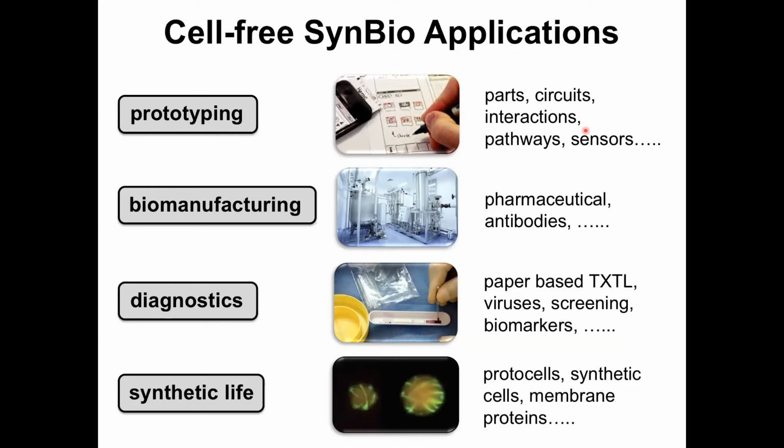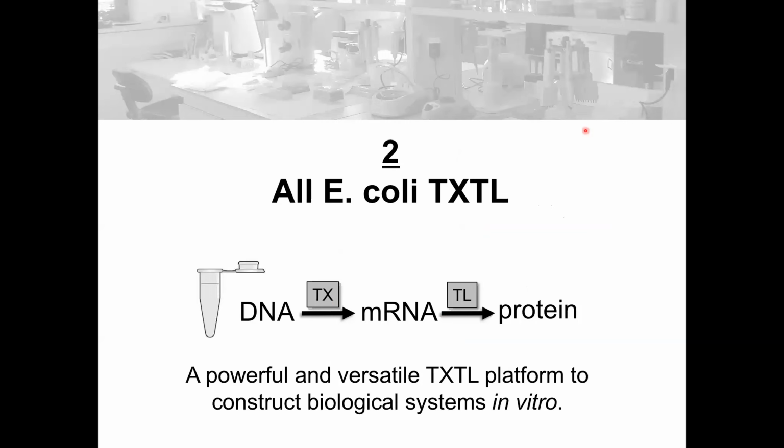And finally, synthetic life, it's picking up very well all over the place, around the world, in Asia, Europe, and now in the US. It has become a sound objective to try to construct living cells from a cell-free expression system. I consider that the cell-free expression system is a major route towards building minimal cells right now. So that's it for this first part, a quick introduction to cell-free expression.